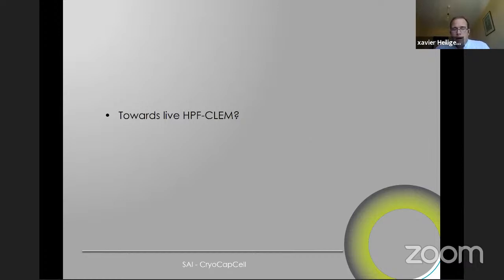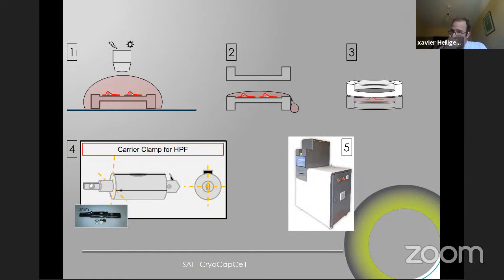Again, I will not go into some technical considerations here. So my main focus during my PhD was to do live CLEM, and this is what I've been focusing on since. So the idea is to go towards live HPF CLEM, because HPF gives you the best ultrastructure preservation possible. So what you want to do is to image a sample alive and then load it into an assembly that will make the sample resistant to the high pressure freezing.